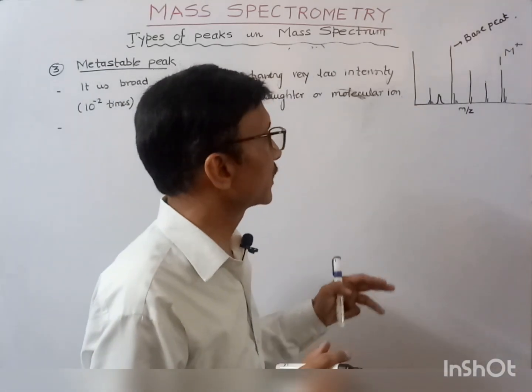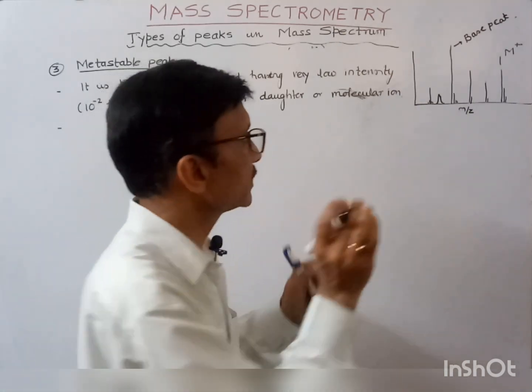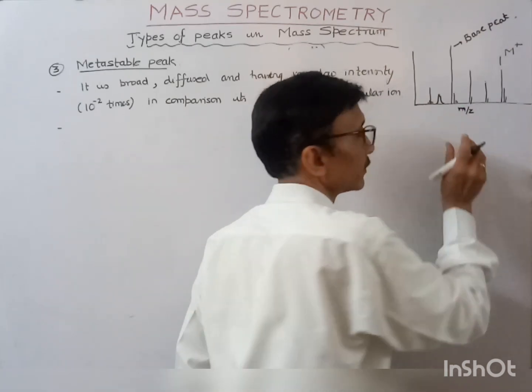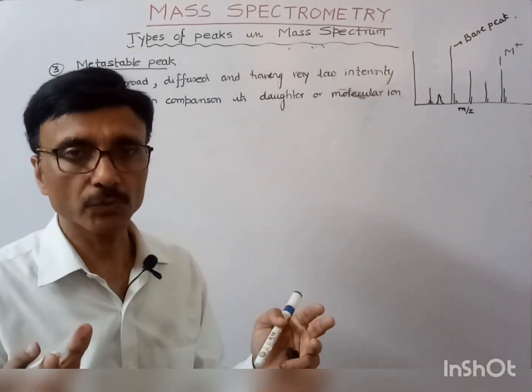Another characteristic of this peak is that it is spread over some 5 to 10 m/z values.